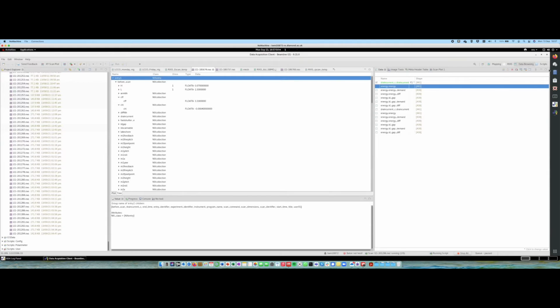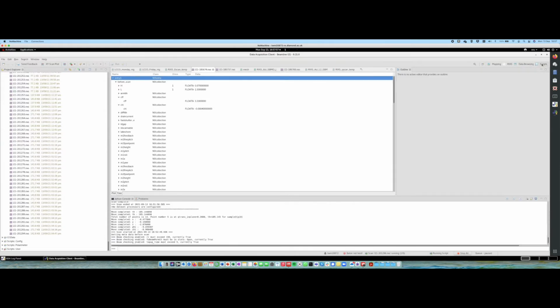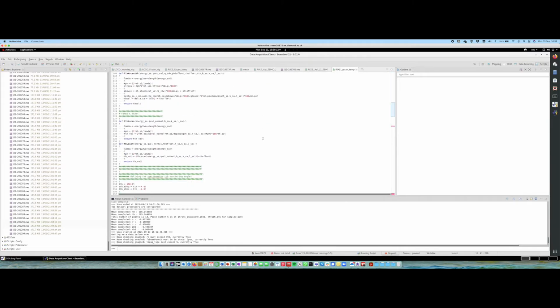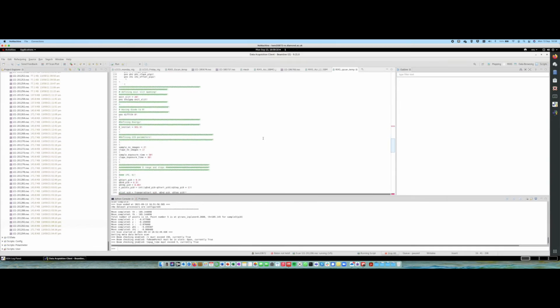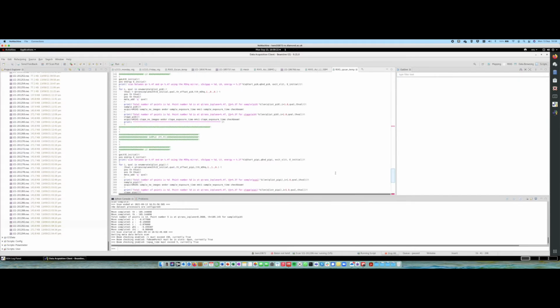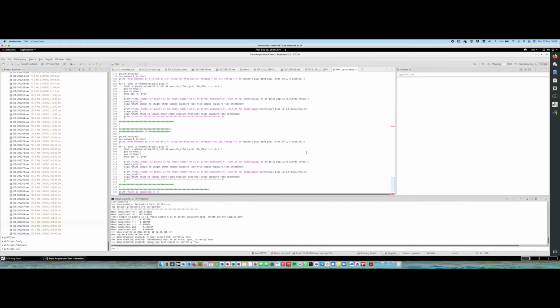Another useful perspective would be to use scripts, in which you can go and open a script. So we have some templates, like this one is a template for a Q scan, and it's written in Python, as I said, which is Java-based Python. And the important thing to remember about that is because it's Java-based, you cannot use NumPy. But there are ways around the most common commands in NumPy, where we can use Java commands for that, and we have written some different templates of the most common macros that you will need to run.